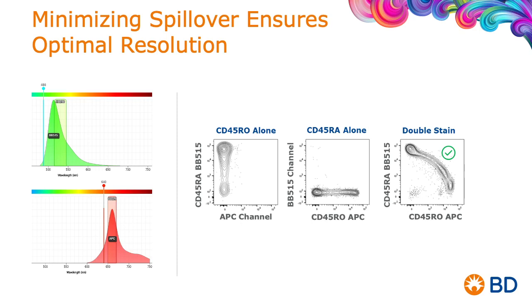So these are two very quick examples of why understanding spillover and spread has an impact ultimately on biology. And while it would be easy now to remember that we have learned that between APC and APC-H7 there might be spillover and not between APC and BB515, one of the major challenges now is how can we keep track of all the combinations of fluorochromes and what fluorochromes work well with each other in a complicated and ever-growing landscape of fluorochromes.